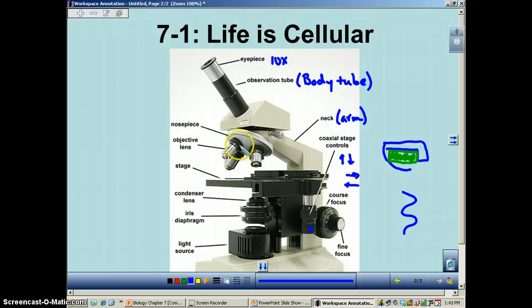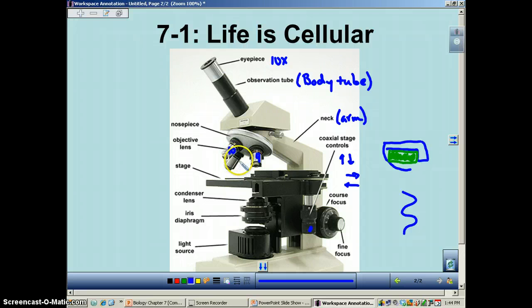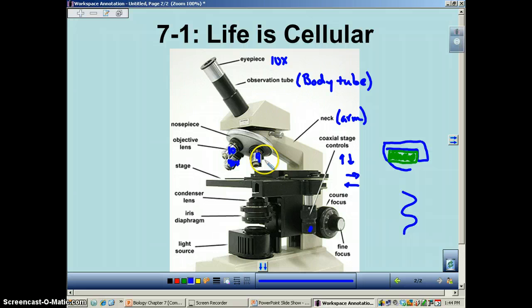The other type of lens — remember you have the eyepiece, and now you have the one that's closest to the object. Here are your objective lenses. See how that one has a red stripe? That would be the 4x. The one with yellow would be the 10x. The one that's probably blue would be your 40x. This empty space in the back is where the fourth or oil immersion lens would be — it's empty here because that one would be real long.